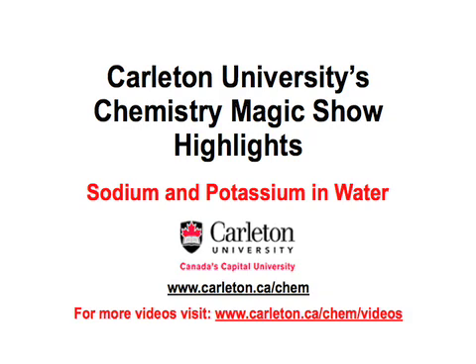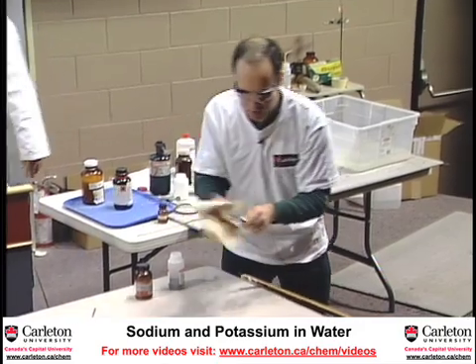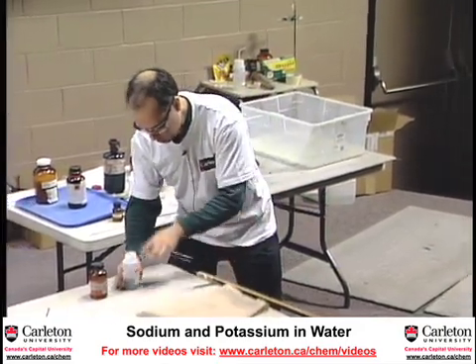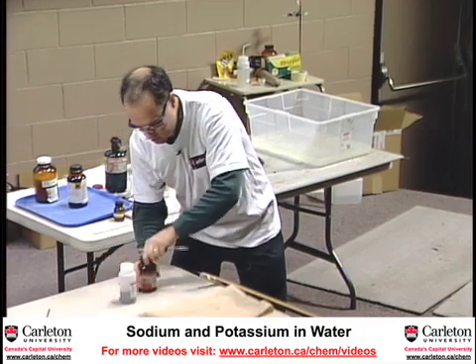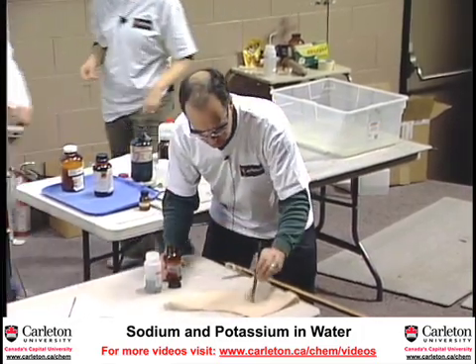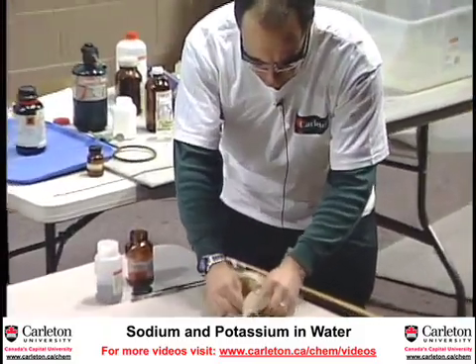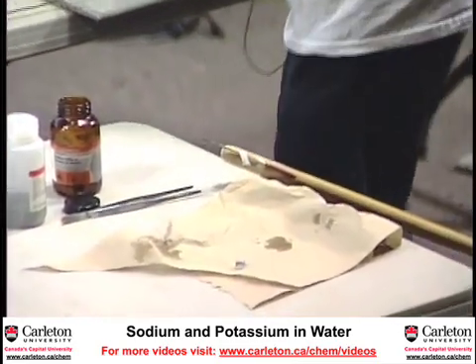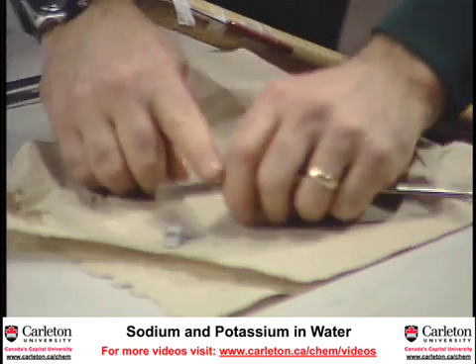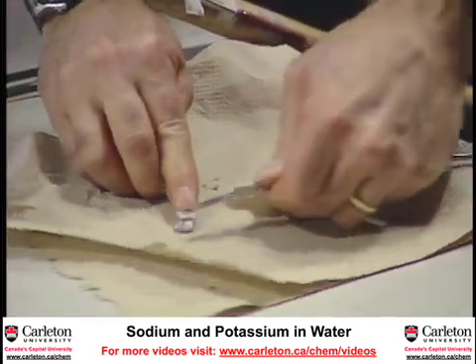Now what I have are two interesting substances. These are both metals. The first one is sodium metal. And this is a metal, although it doesn't really look too much like one. It's kind of dull and gray, but these are very soft. And so what I can do is actually cut this like butter — I've cut right into it with this spatula.